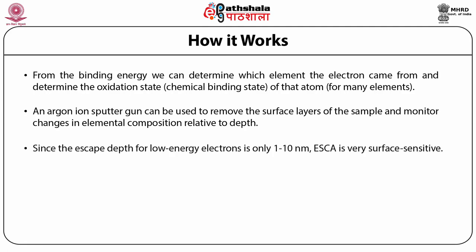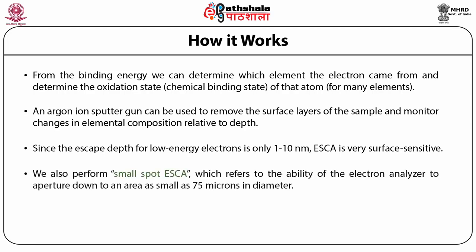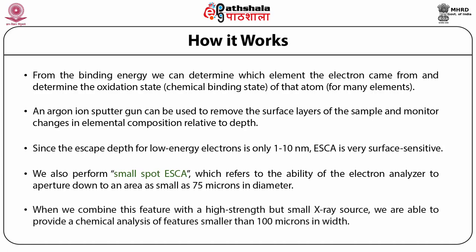Since the escape depth for low energy electrons is only 1 to 10 nanometers, ESCA is very surface sensitive. We also perform small spot ESCA, which refers to the ability of the electron analyzer to aperture down to an area as small as 75 microns in diameter. When we combine this feature with a high strength but small X-ray source, we are able to provide a chemical analysis of features smaller than 100 microns in width.